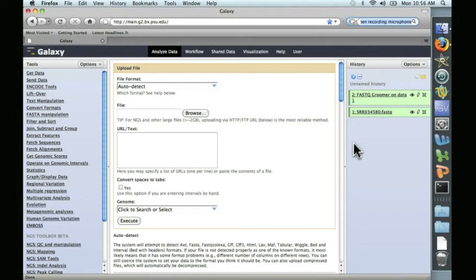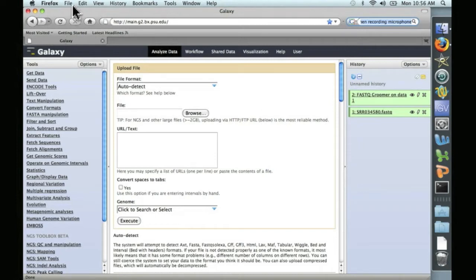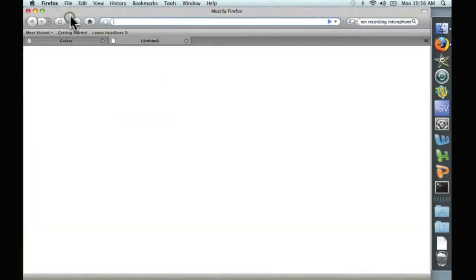Now we need a cDNA database to align this to. Because finding a cDNA database will be very specific to the experiment and the organism at hand, I've just gone ahead and bookmarked the one we need.